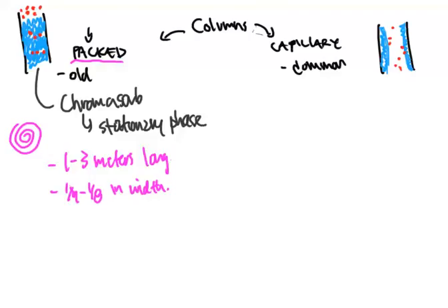And that's why you don't really need to split your sample up in terms of split or splitless. You can just directly inject it onto the column and directly vaporize it and let it go through the column itself. The flow rates for these things, because they are much larger columns in dimensions, can go anywhere between 10 to 40 milliliters a minute. All right, and that's a lot, especially when you start comparing it to the capillary column, which we'll do in just a second.